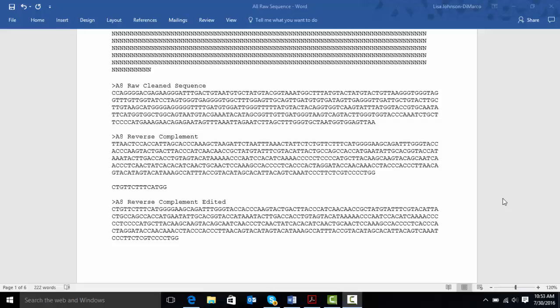Hi and welcome back. This is the second video that's designed to help you in your process of determining your haplogroup from your mtDNA HVS1 sequence. In this video, I'm going to show you how to align your cleaned up reverse complement sequence with the reference sequence. You'll also see how to properly number the alignment so that you can determine what your mutations are and what your haplotype is. Once you determine your haplotype, then you're going to use a number of different sources to try to figure out what haplogroup you belong to.